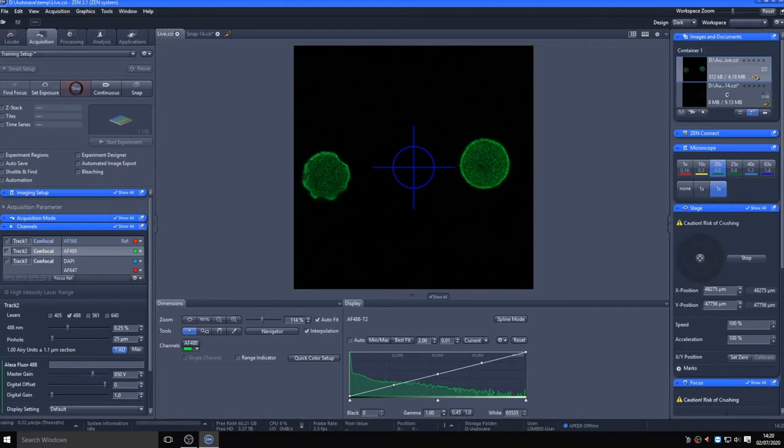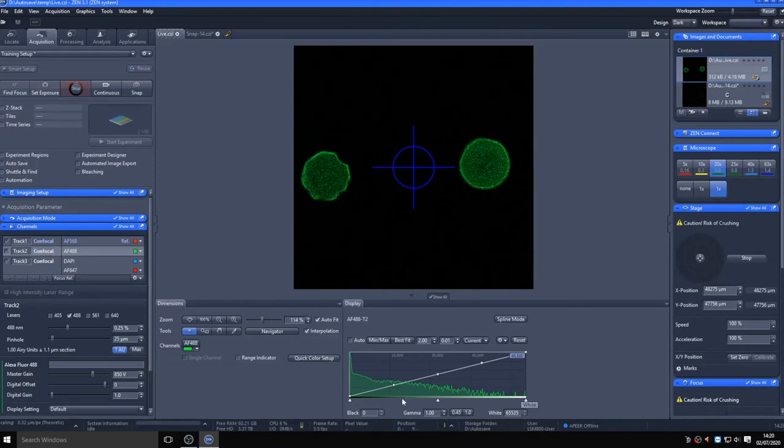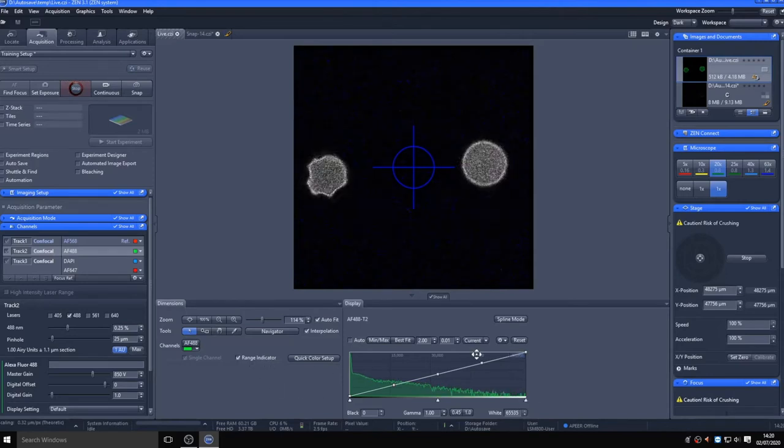It appears okay at our previous focal point, but it is overexposed near the outer focal range.